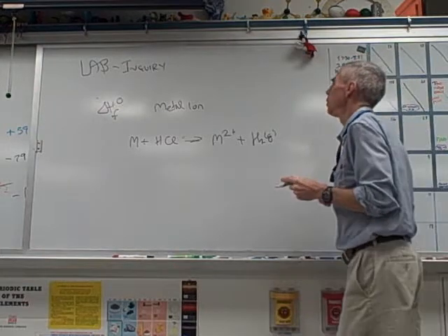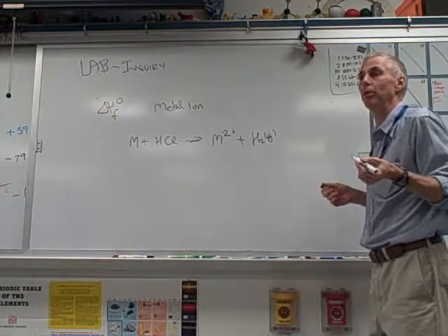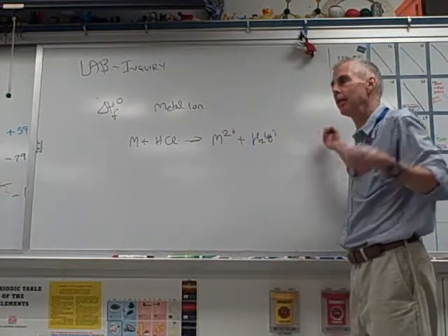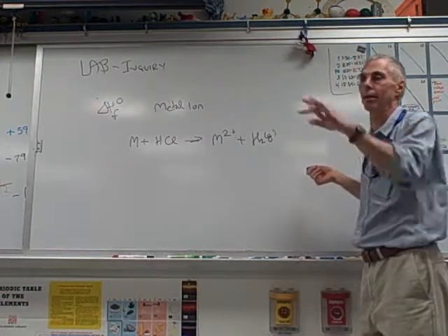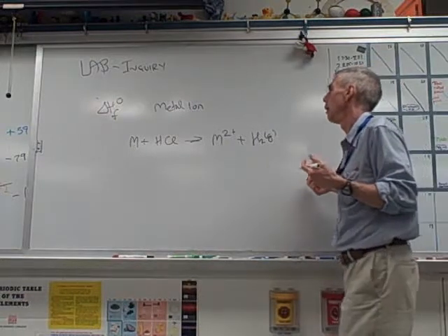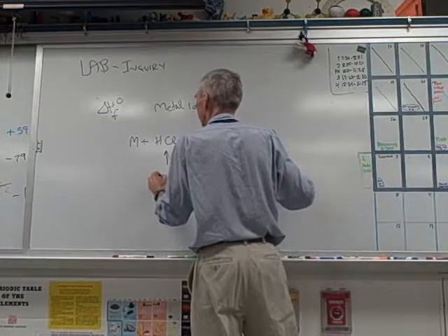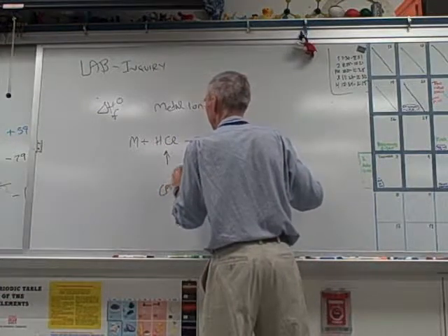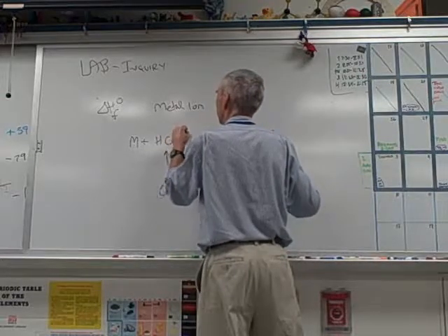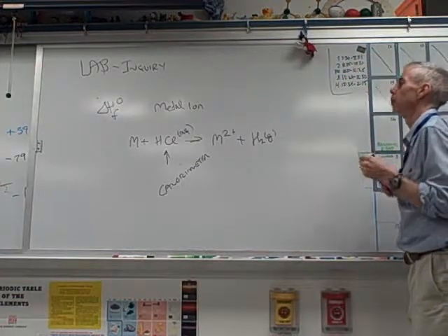All right? So what you can expect is something like this. The reaction is ridiculously simple. If you throw a metal into acid, you get hydrogen gas and ions. Pretty much guaranteed, unless it's like gold or silver, one of the royals that don't react. Now, the HCl is going to form your calorimeter. It's a solution. This is aqueous. It's HCl in water, and it's going to form your calorimeter.